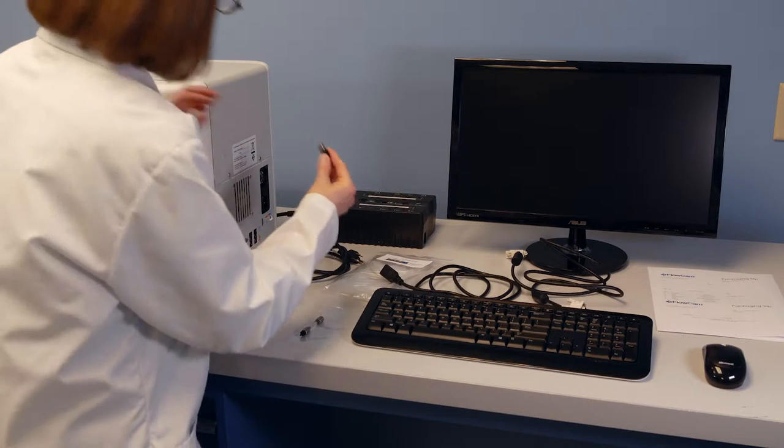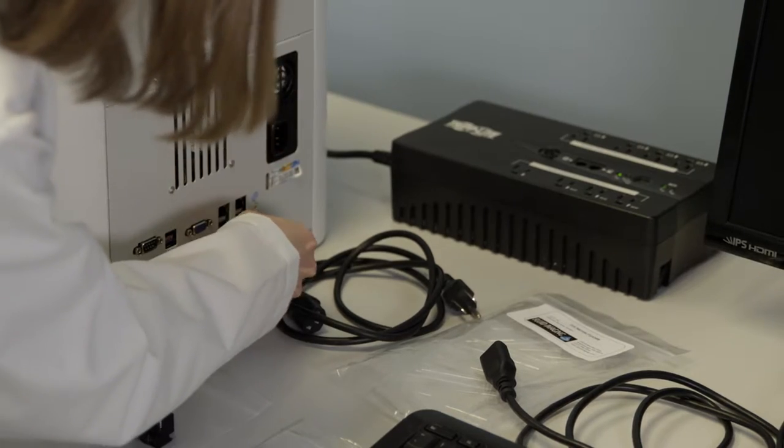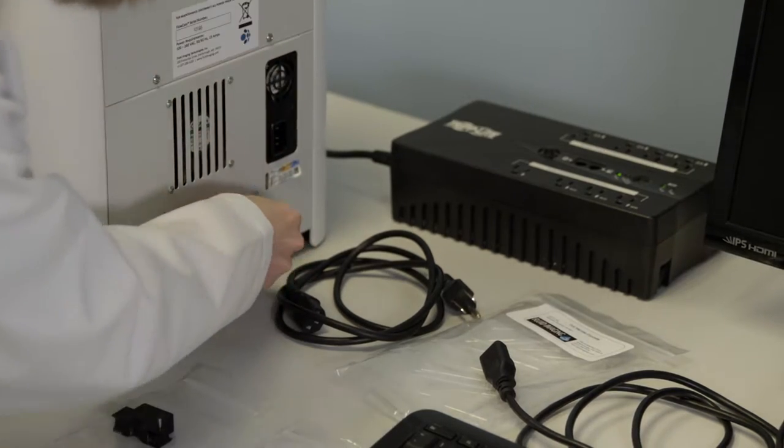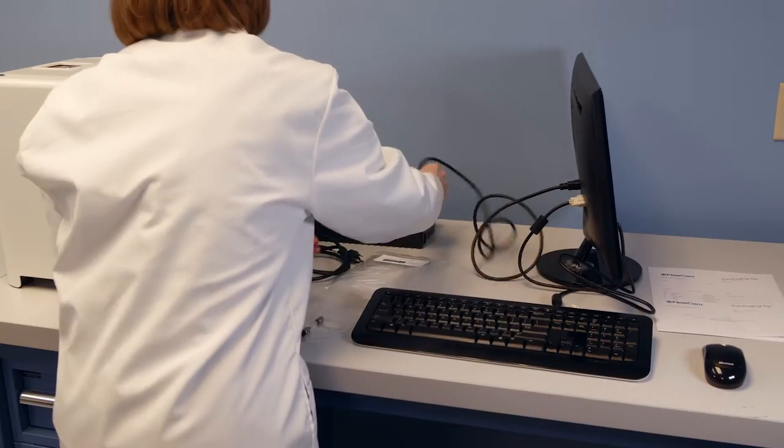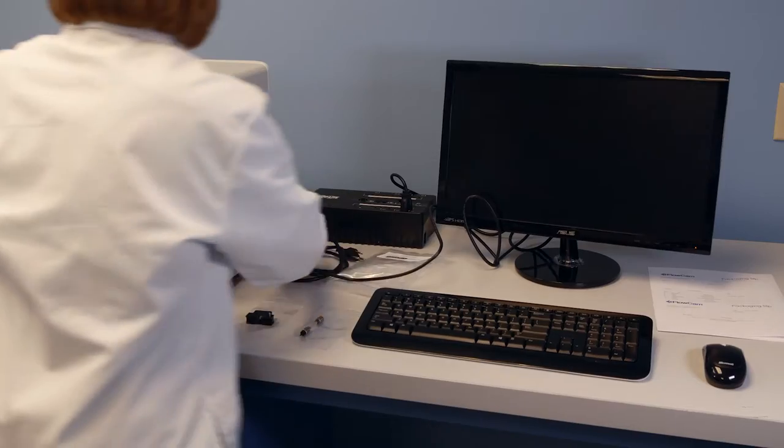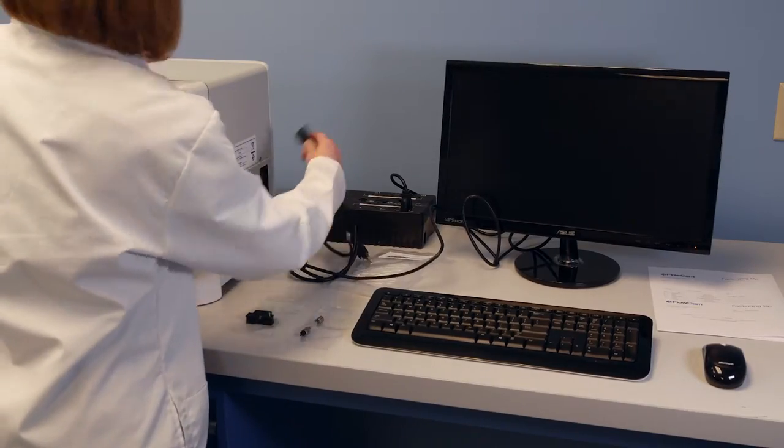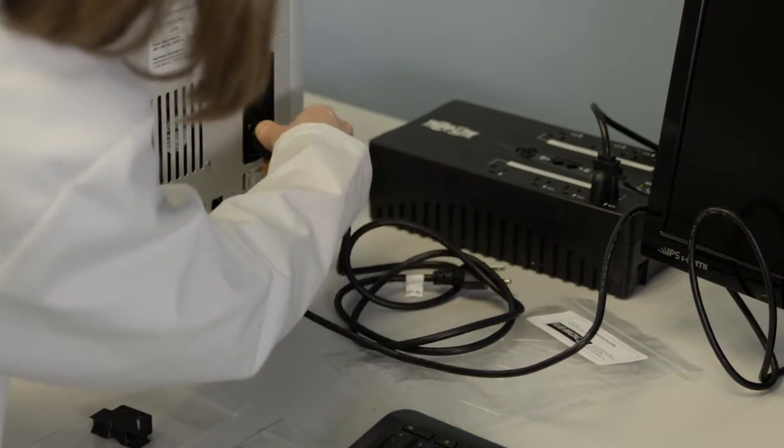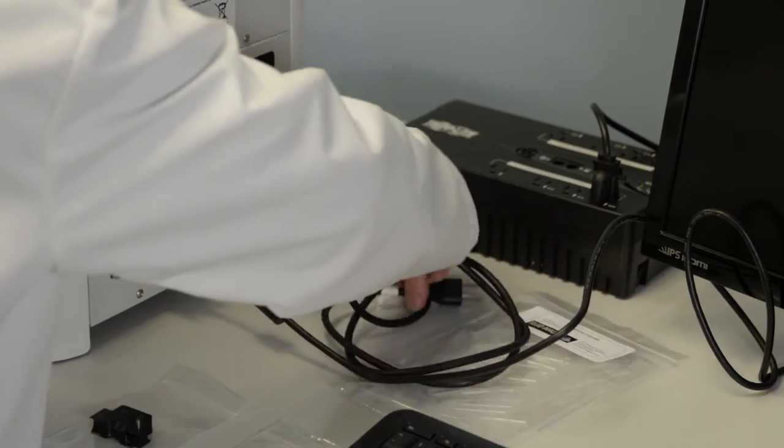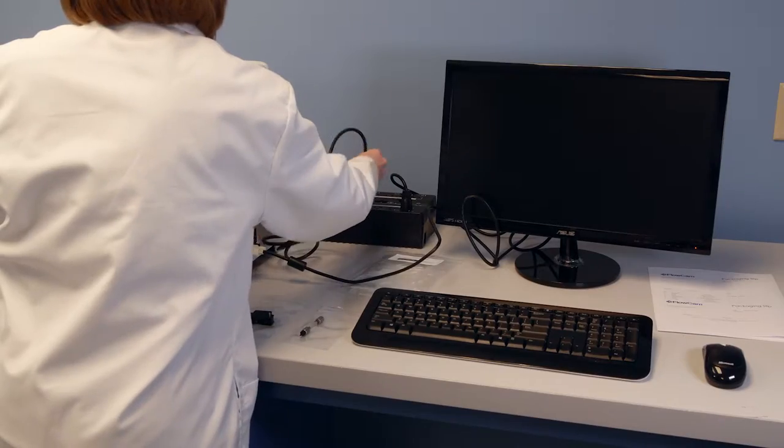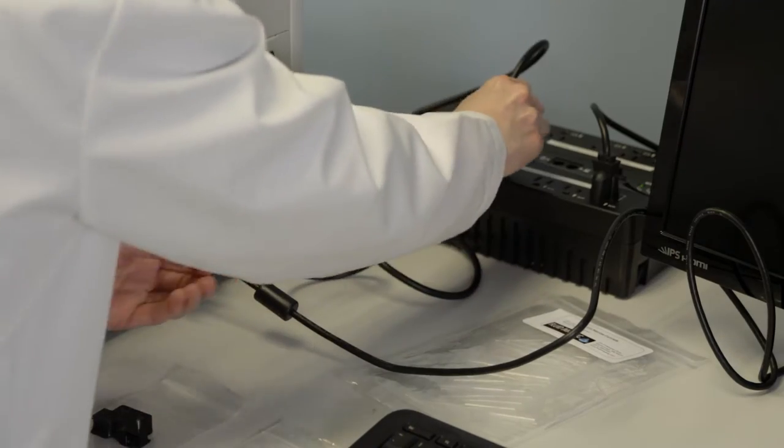Start by plugging the keyboard, mouse and monitor connection into the back of the 8100 as shown here. Then plug the monitor into a power outlet. Next, locate the power cord for the 8100 and plug it into the back of the machine as shown. Then plug the cord into a power outlet.